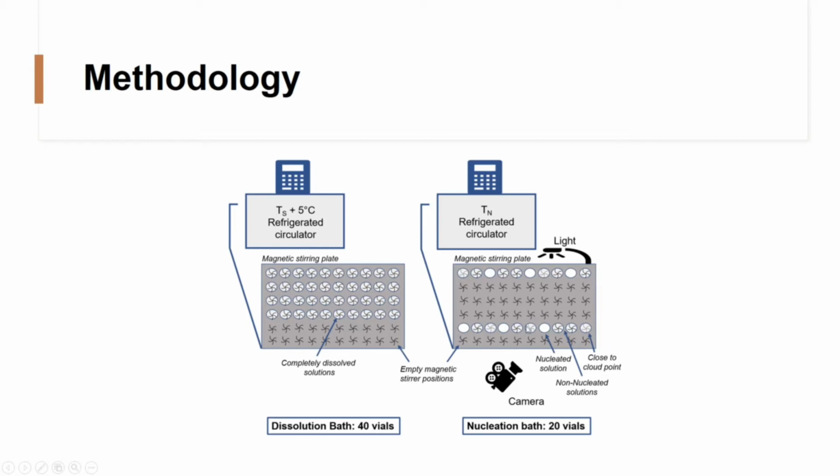Sometimes 2 or 3 vials can nucleate at the same time. At that time we have to write that at that particular instant, say three vials nucleated. So you have to add the vials: first vial, second, third, and then if 3 vials get nucleated, it will be 4, 5, 6. So 6 vials nucleated at that particular instant of time. And I think Shubangi put something like a light, because I remember she used an LED light.